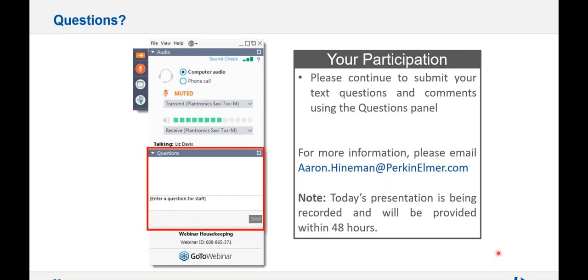The Guide to Techniques and Applications will give a listing of instrument detection limits by AA, ICP, mass spec. So I would always start at the Guide to Techniques and Applications, and you generally want to stay 10 times above the instrument detection limit. Also the Flame Cookbook helps as well, which is available.